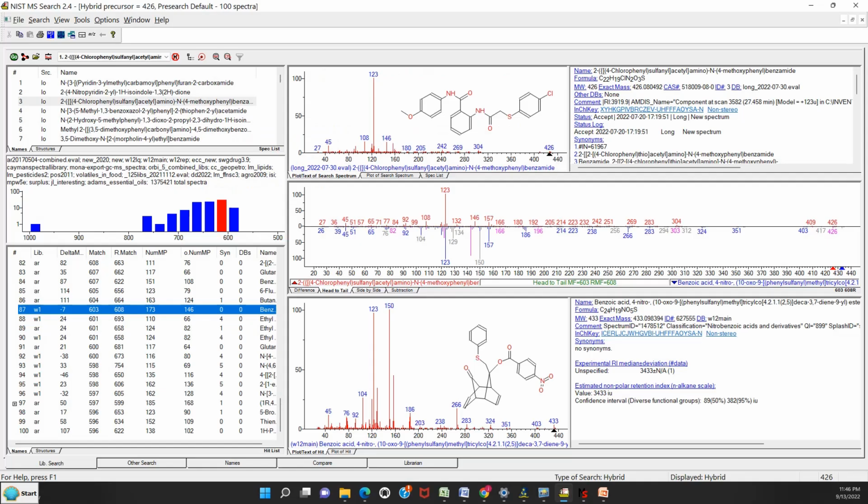I now have opened the NIST Search program, and if you find any entry that you want that has a structure, we'll go down to the hit list from a search. I'm going to pick this 87th entry in the hit list. It's actually a Wiley spectrum, and you can see its structure in the pane to the right.